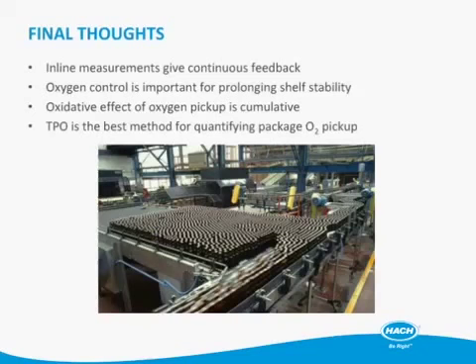Oxygen control is really important for prolonging shelf stability, and I don't know of a better method than total package oxygen for quantifying O2 pickup and helping you troubleshoot fillers and areas of O2 ingress.